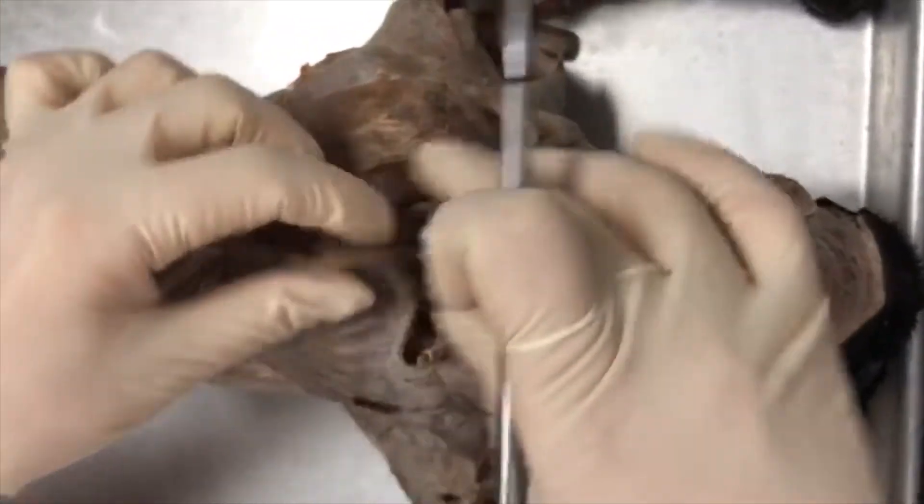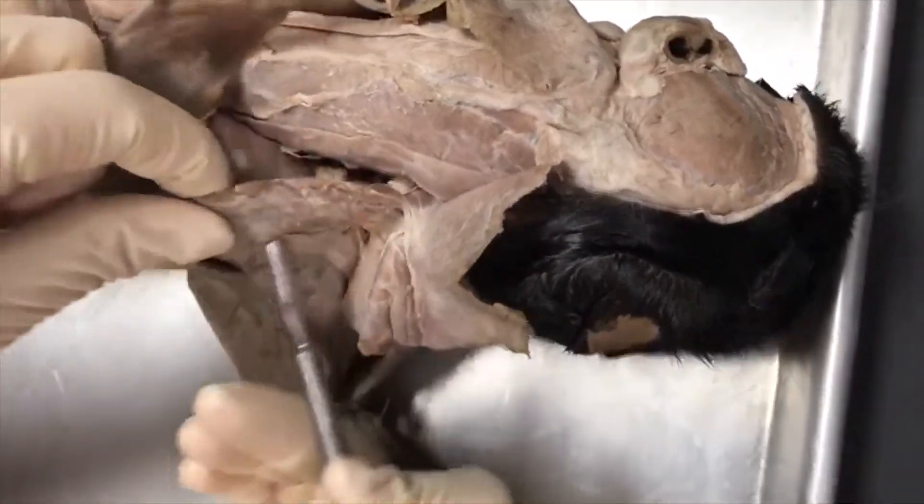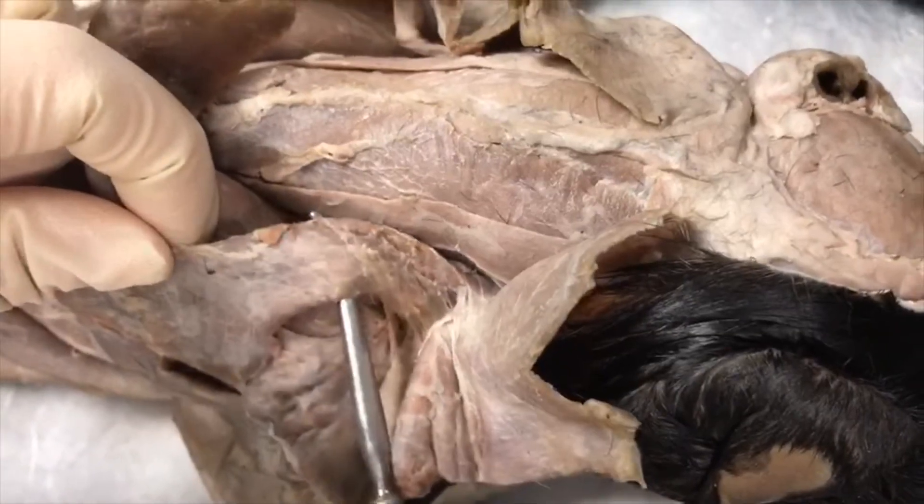If we pull back the clavotrapezius, this muscle here is going to be your levator scapulae ventralis.